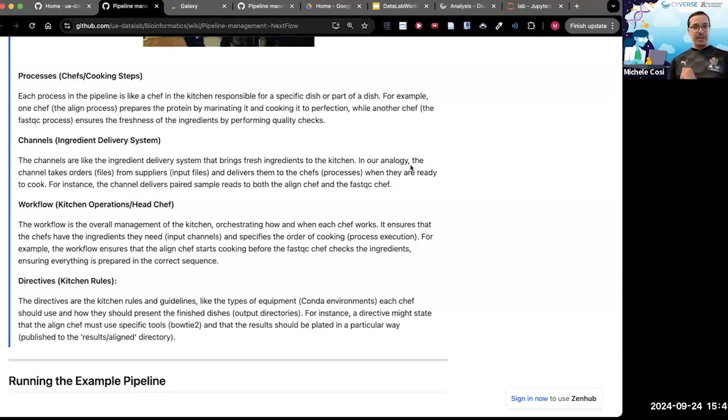In the earlier version of Nextflow, using DSL1, they did not have workflow at the bottom. They actually had each various channel being more explicit, each various process being more explicit. And if you wanted, and I did this a lot, I could follow this with a finger, whilst now it is a little bit more difficult, and my finger goes all the way to the bottom, and it's looking at workflow right at the bottom. So I did not mean to be harsh, Cora. Thank you for the question.